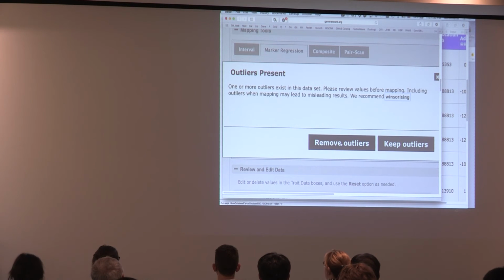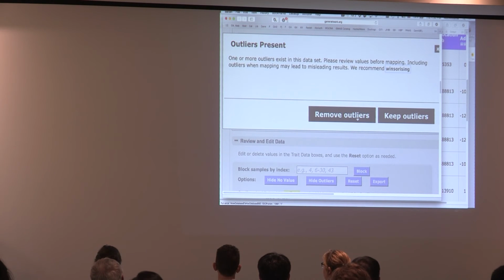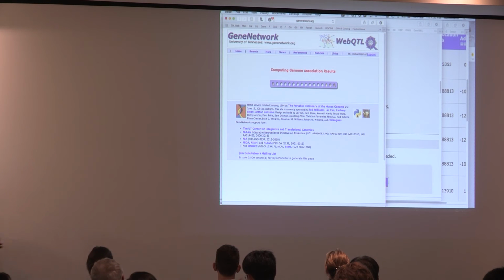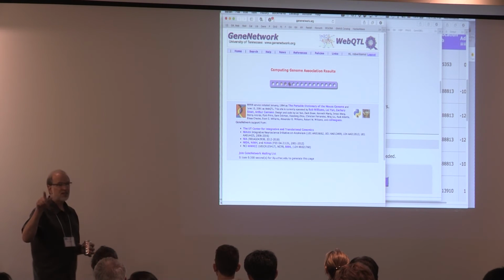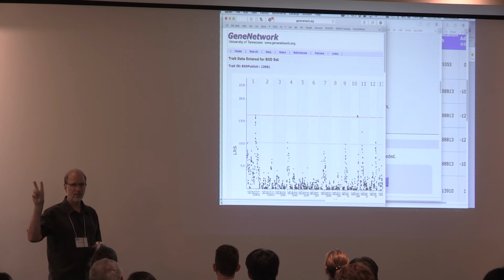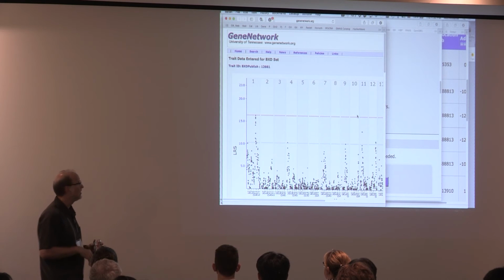It says, "Rob, you idiot, I don't want you to spend another $10,000," so this is a thing we put there. Do you want us to remove outliers for you? So let's say, okay, fine, let's remove the outliers. Now it did something a little hardcore here. It just threw away 2 of my high brain weight cases, BXD5 and BXD whatever.